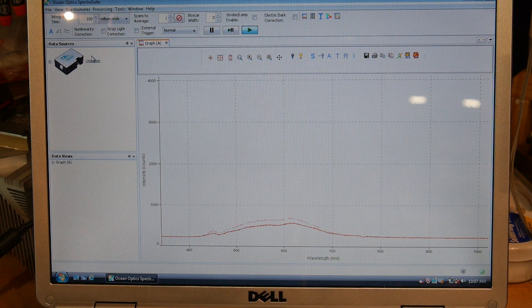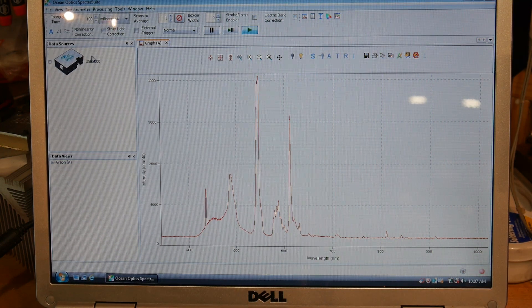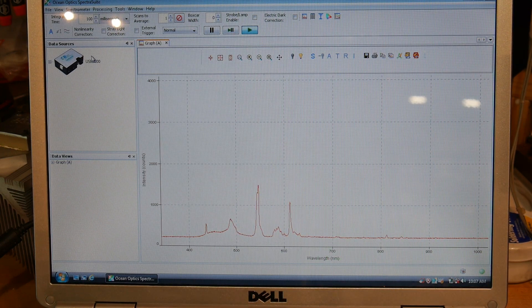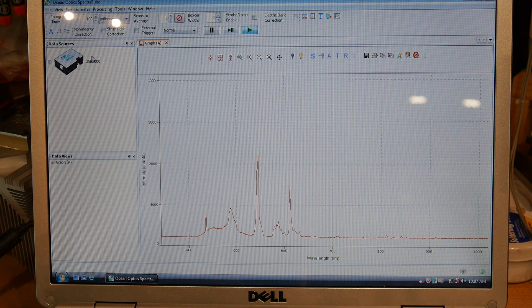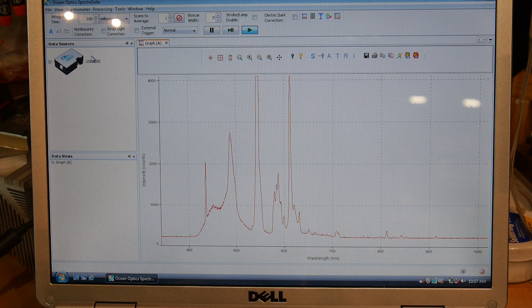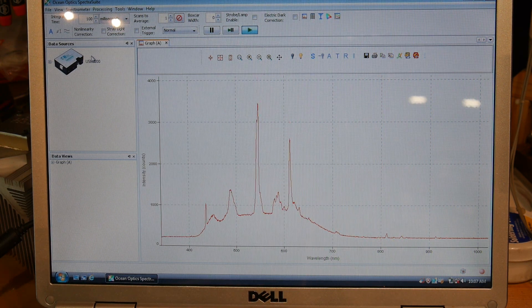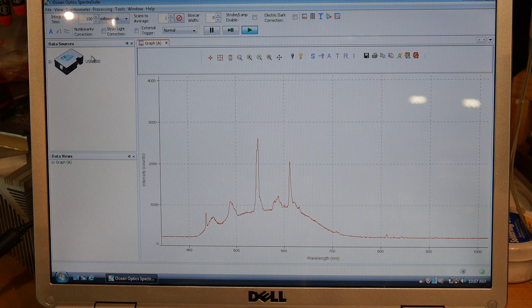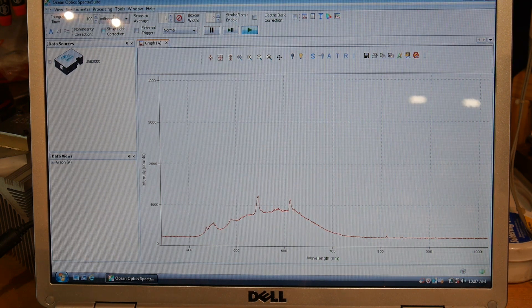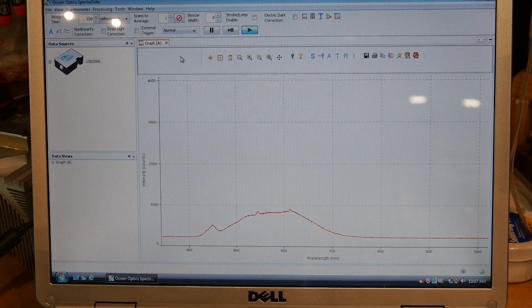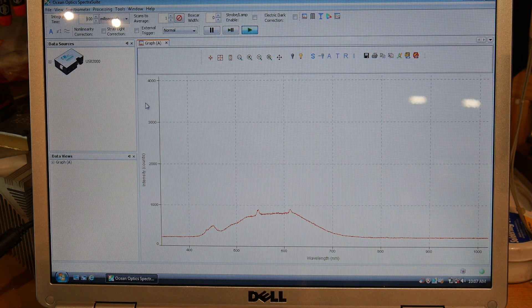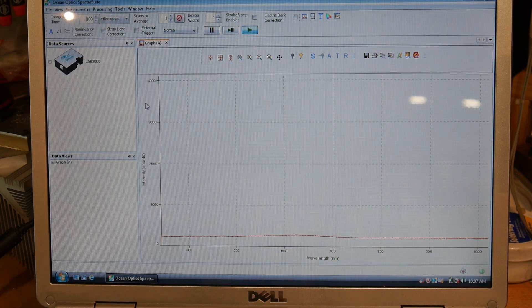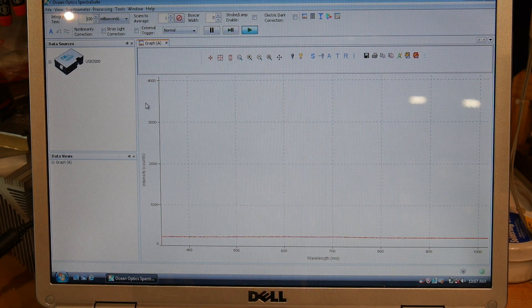So we can look at spectrum real time, and it's a very cool machine. You can capture it and do other things with it, but for right now we're just going to look at some things. So I thought what we'd do today is have some fun.